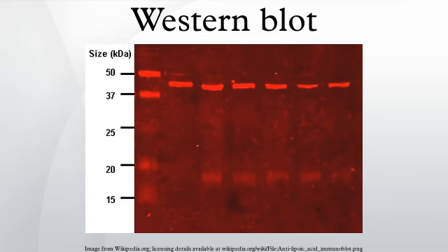A third alternative is to use a radioactive label rather than an enzyme coupled to the secondary antibody, such as labeling an antibody-binding protein like Staphylococcus protein A or streptavidin with a radioactive isotope of iodine. Since other methods are safer, quicker, and cheaper, this method is now rarely used. However, an advantage of this approach is the sensitivity of autoradiography-based imaging, which enables highly accurate protein quantification when combined with optical software.